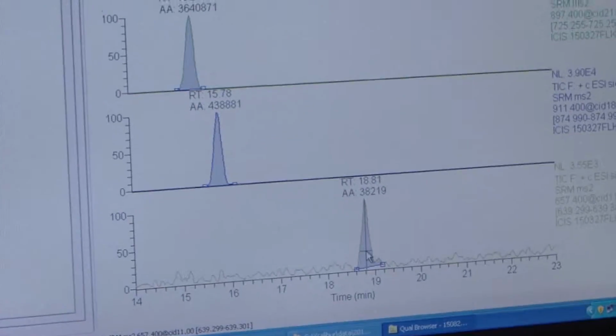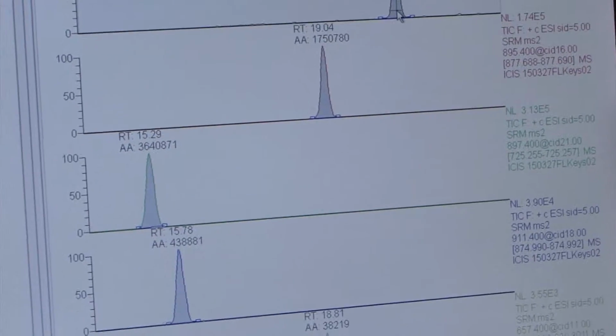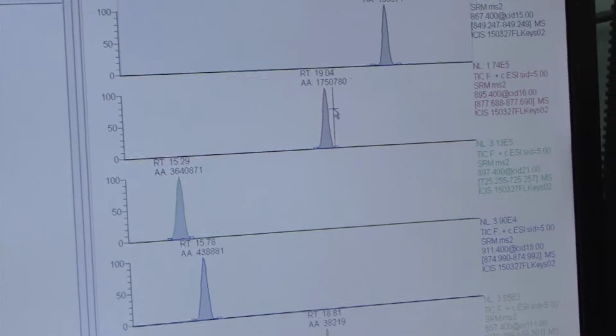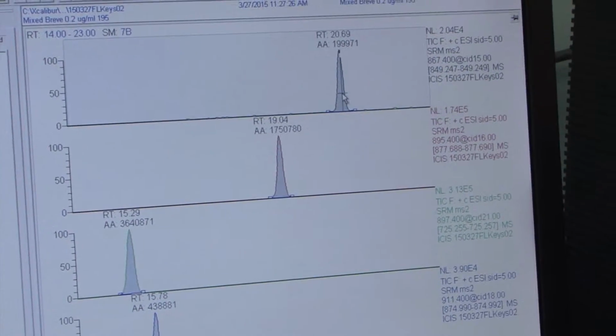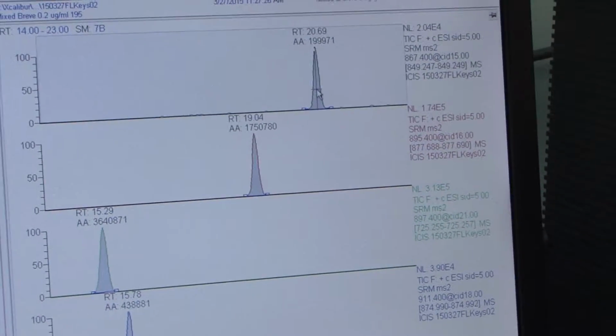What we do is we actually purchase analytical standards from a vendor, and we run them on the instrument so that we can see what toxin gives what response for a given amount. We develop calibration curves based on these responses so that when we get an unknown, we can compare it to these known responses and quantitate what's present in our unknown.